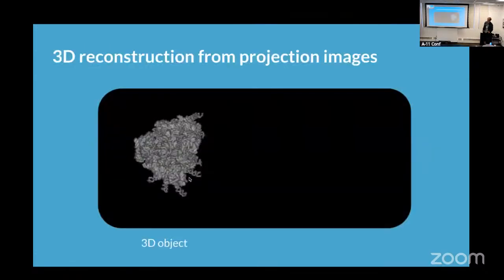And so if we think about tilt series processing as frame series processing, but with a few extra things that we need to keep track of because we've imaged the same area of the sample in the scope multiple times, I think it's a useful mental model and lets you understand why we have to do things in certain ways and how to do them better in some cases.